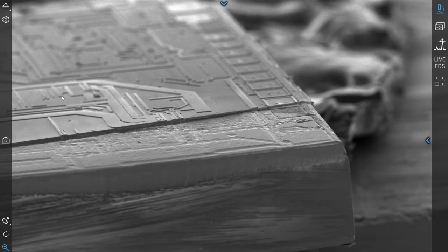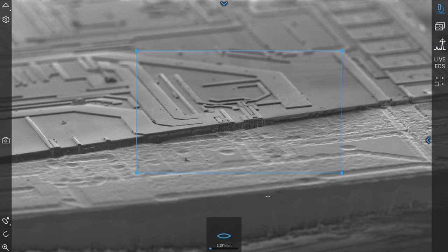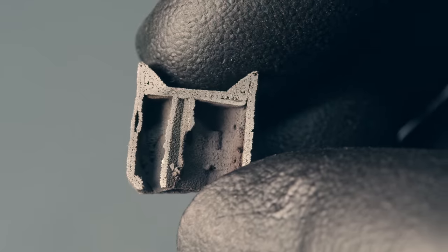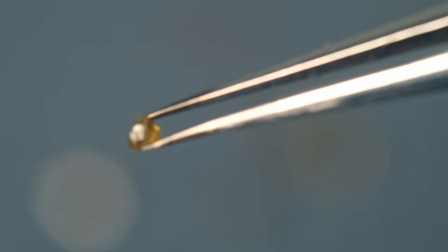This technique can be used for cross-sectioning computer chips, very gently polishing optics and metal samples, and even etch the hardest substance we know of, diamond. The device is called an ion mill, and it uses a highly energetic ion beam to etch any surface you put in the way. And while the description sounds a little bit like science fiction, it's actually a pretty common instrument used in many research labs.